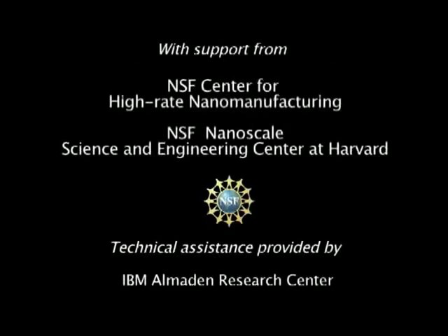The microscope's up and running, so if you want to come up and try moving an atom, I'd suggest come on up. We'll give it a try. I'll bring it back right there. Okay, left leg. It's gone.